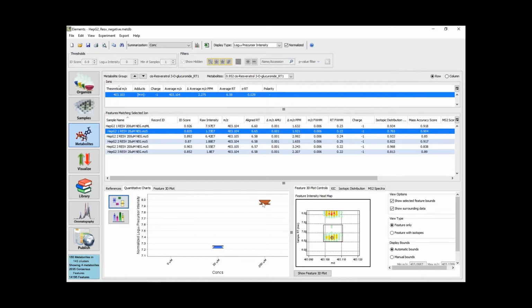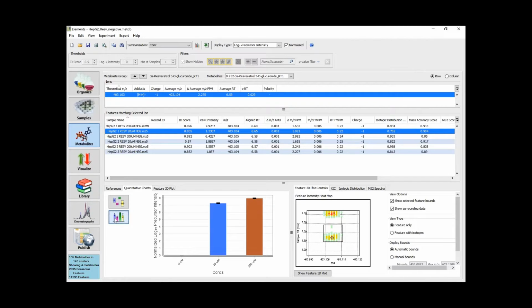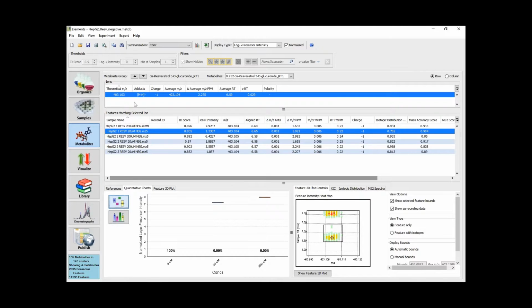I'll zoom in even further, and you could see the 3 samples and their standard deviation and what the average precursor ion intensity is. If you go down to the other box here, what you're going to see is just the same details. It's in a bar chart with error bars in it. And I can zoom again in here and look at what the error bars are between the samples. And that's a really nice feature. It lets you look at your data pretty quickly among your compounds.